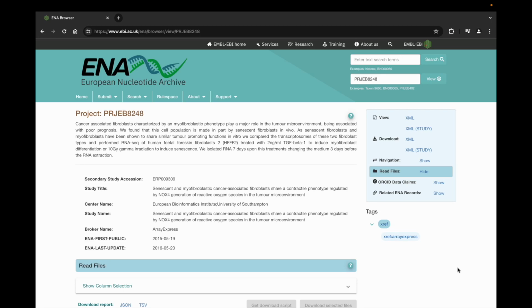So I've put a link to this project repository page shown here in the companion blog post. If you visit this, you can see a detailed description of the samples, as well as get hold of the metadata file, but there's also a direct download link for that in the blog post. The easiest way to download all of the fastq files that we're going to need at once is using a small shell script, such as one that I've already preloaded into my shell folder.